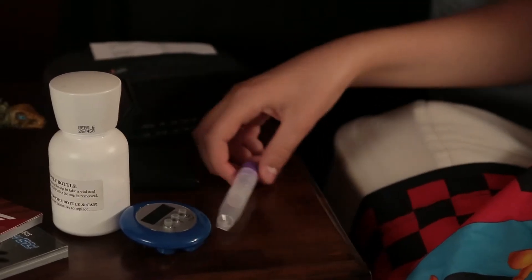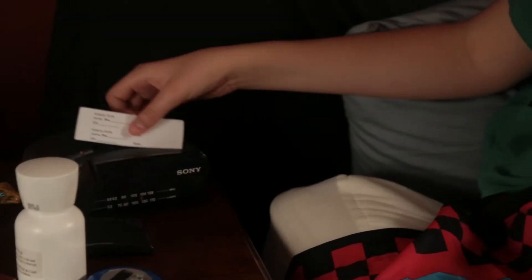Got it. Now what? Well, once it's nice and soggy, put it in the vial. And that's it? Almost — you'll just fill out the sticker with the date and time.